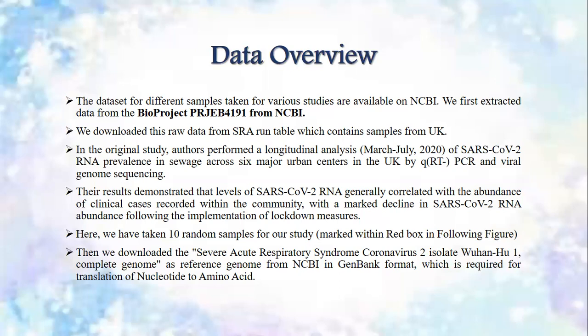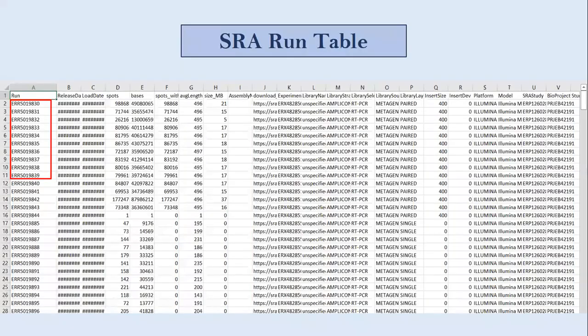Here we have taken 10 random samples for our study. We also downloaded a reference genome from NCBI in GenBank format, which is required for translation of nucleotide to amino acid. This reference genome was the severe acute respiratory syndrome coronavirus 2 isolate. This is the SRA run table which is the dataset for our project. The 10 samples marked in the red box are the 10 random samples we have taken for our study.